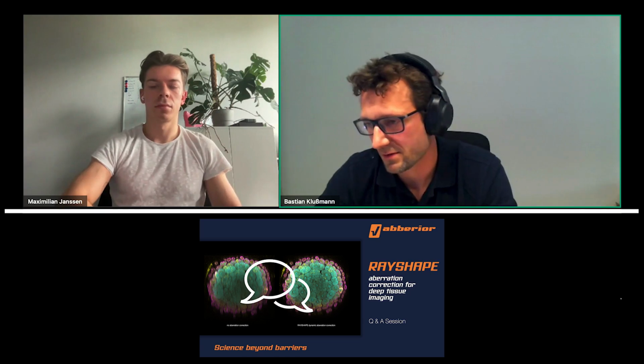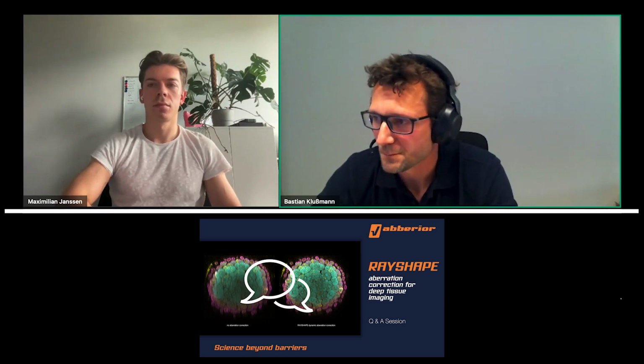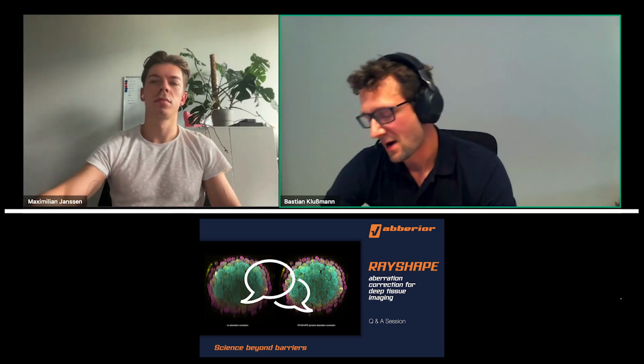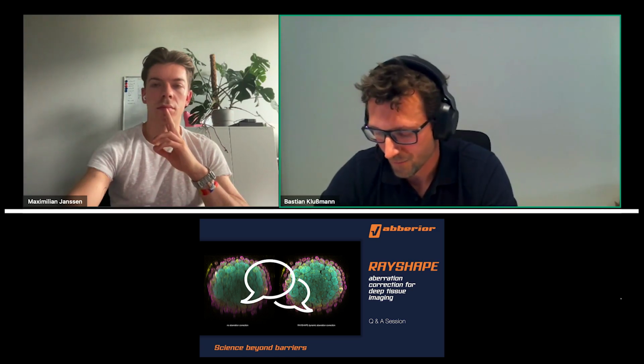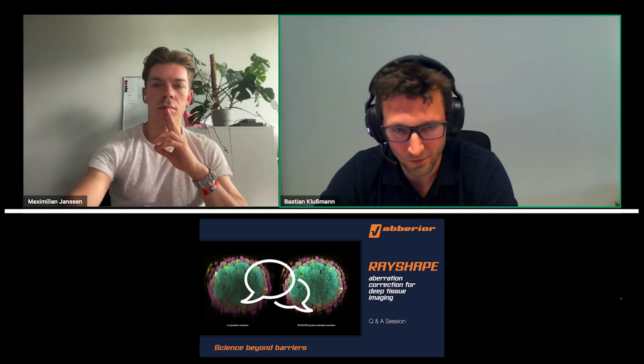However, in the background of course runs our expert software, which is Inspector. We didn't cover that during the webinar here. It is by far more complex, and you can really have access to all the different functions of the deformable mirror. With Inspector, you can also improve the adaptive optics even a little bit more by using our SLMs, which we use to generate the STED donuts. You can even improve the quality of the correction a little bit more if necessary, although we figured out that in most cases the deformable mirror is completely enough.